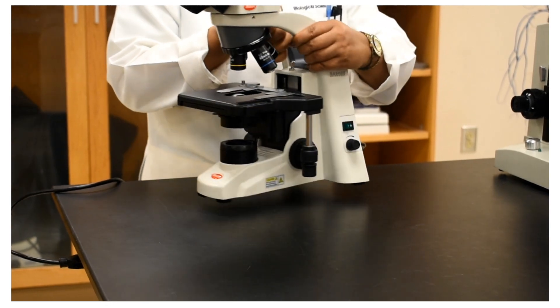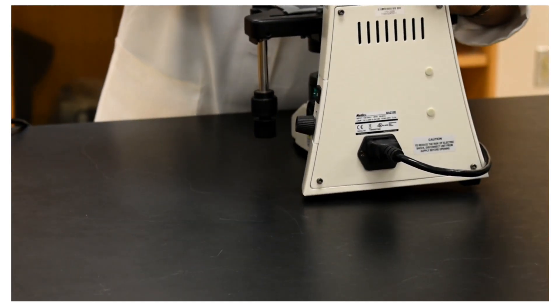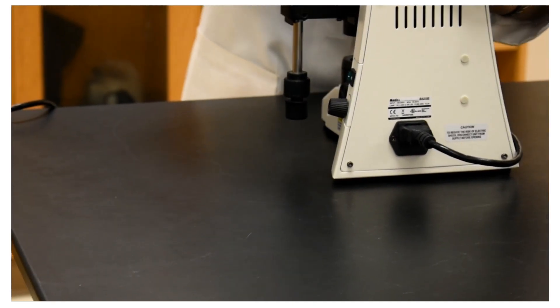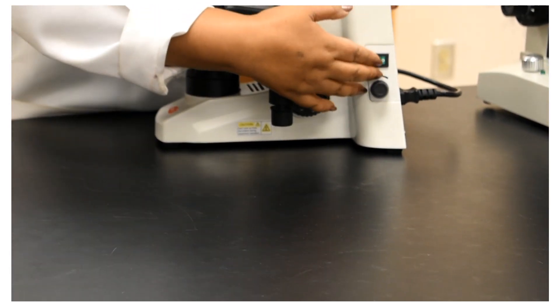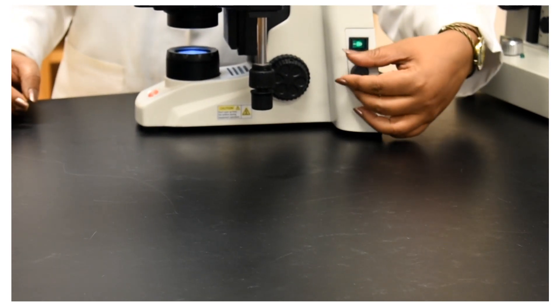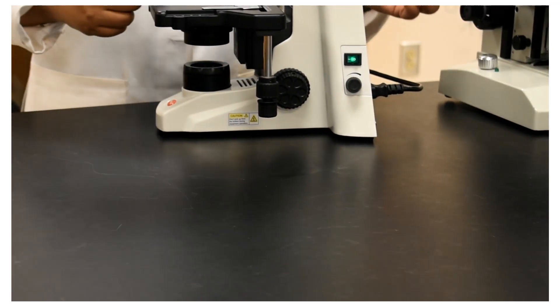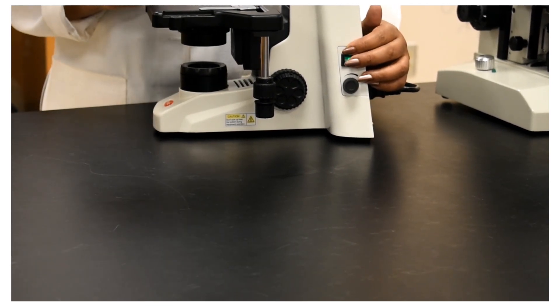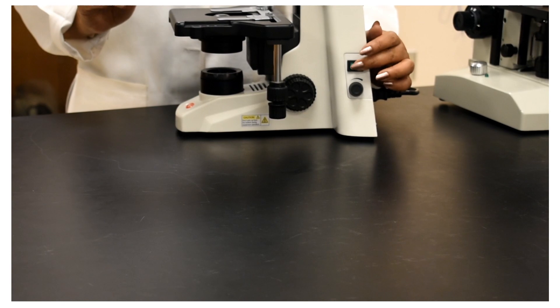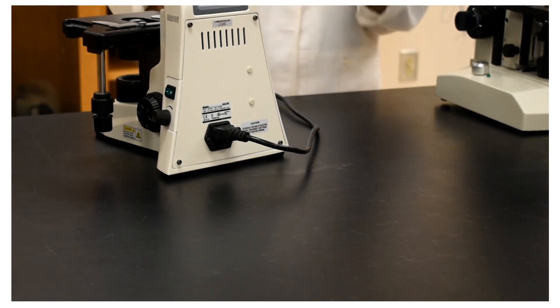For the Moti microscope, the light switch will be on the right side — that means when you are looking at the microscope with the ocular lenses facing towards you, the light switch will be on the right. Once you turn on the light, the brightness control knob is right below the switch, so you can control the brightness from there. Always remember: when you are not using the microscope, do not keep the light on. Always turn it off, because the light bulbs burn out pretty easily and they are expensive.